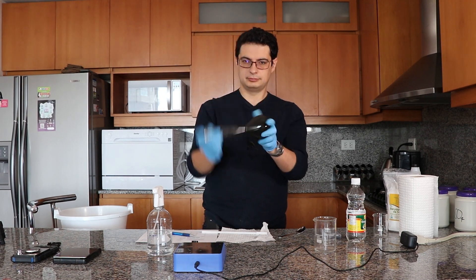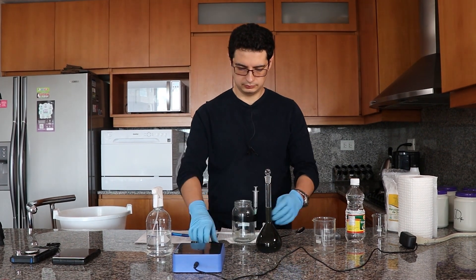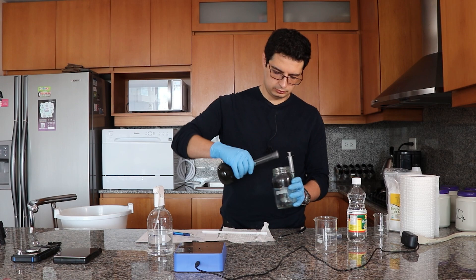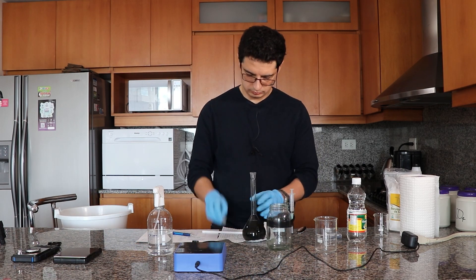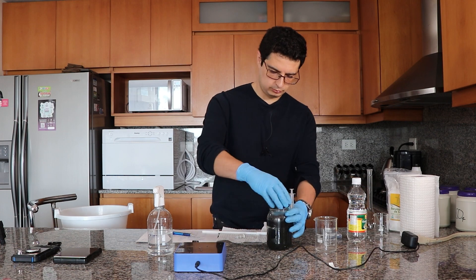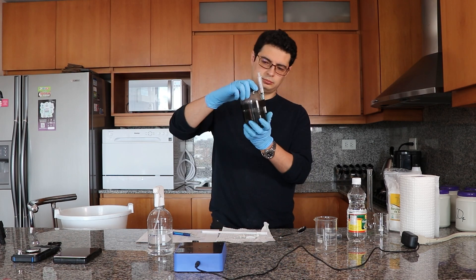I'm taking it to final volume, homogenizing, and this will be the final micronutrient solution. I have a jar here where I'm going to store it — I'm purging the jar with some of the solution to ensure I'm not contaminating it with anything remaining inside, then pouring it in. We also have a label to apply, though the dye makes it hard to confuse with anything else.